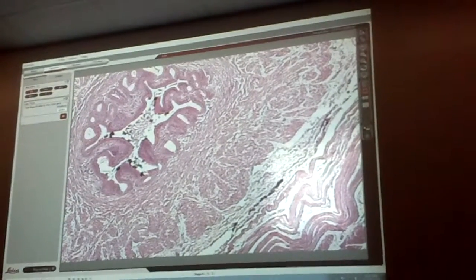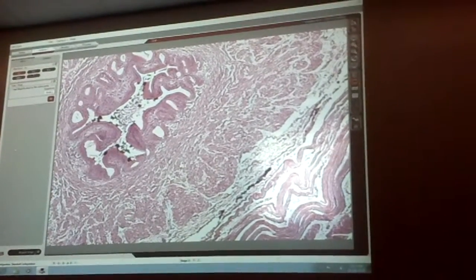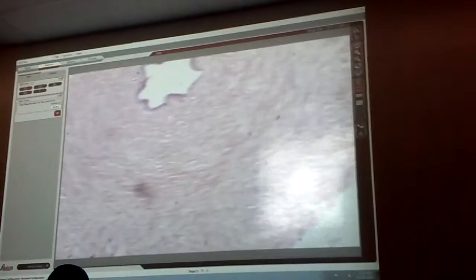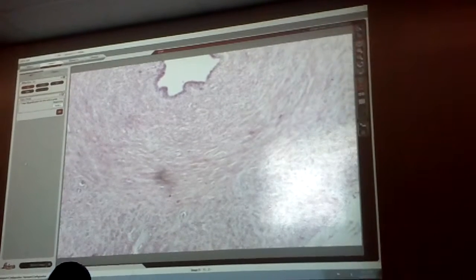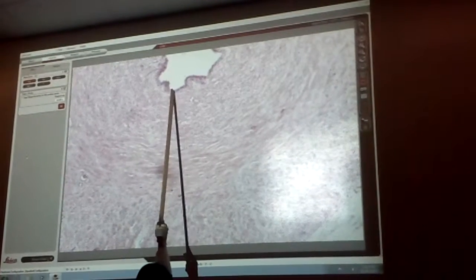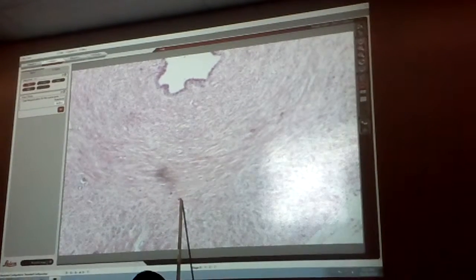There's no point in making this super hard. Ooh, that one's a good one. You see the different layers? Oh, yeah. Okay. So we have our PSCCE here. Longitudinal is going to go from here to about there. Circular from there to about there. And then longitudinal.